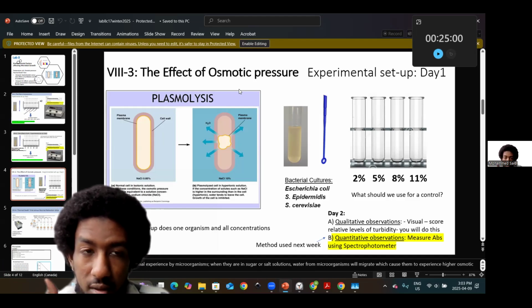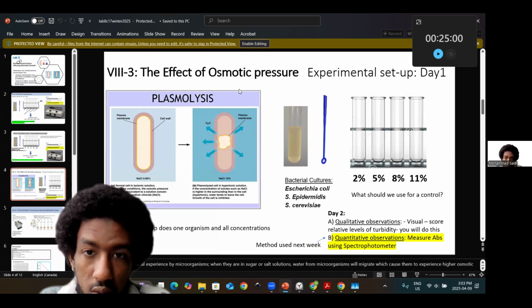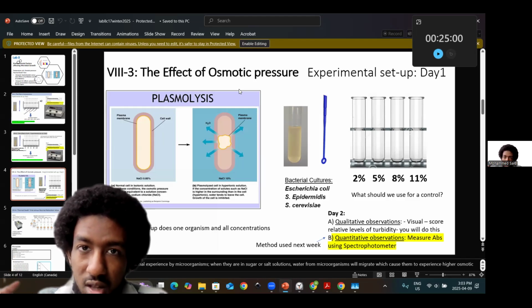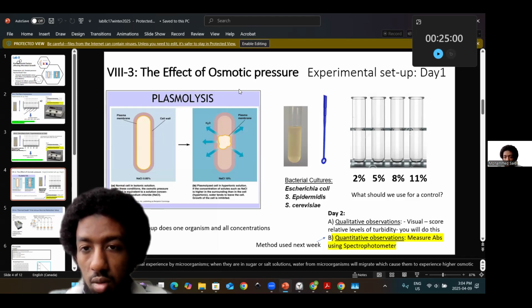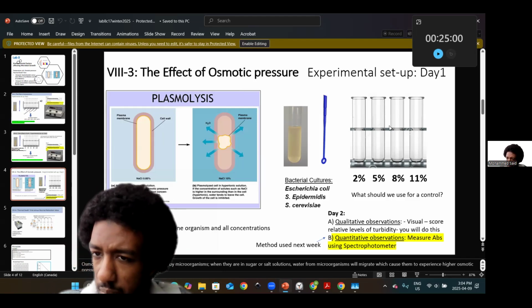And that's similar to the case of our germicides. So connecting back two weeks before, the impact that you have with osmotic pressure, be it of ethanol or of bleach, because bleach is also a hypertonic solution, hypotonic solution, that these include solutes, right? So think about the implications of the ions separating in the solvent, and thereby the impacts they have on the survival and growth or reproduction of your bacteria, post-binary fission. And so think about that.